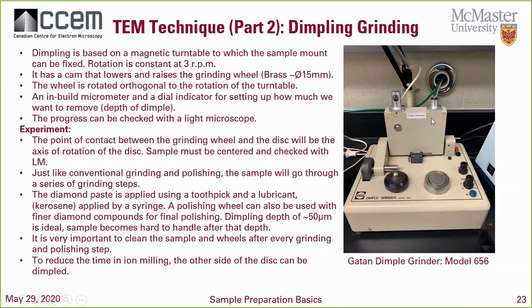Our sample sits here, we lower the cam. We use our lever here to lower down the depth, and this measures how much we want to remove. The micrometer is on the other side of this cam here, right? We lower it down, we measure how much we want to remove. We add, using a toothpick, our dimple grinding compounds or our diamond compound.